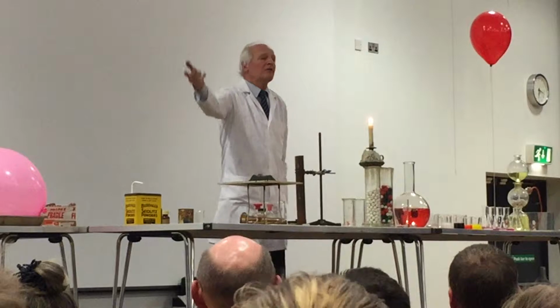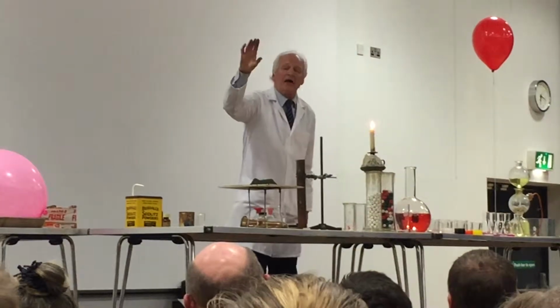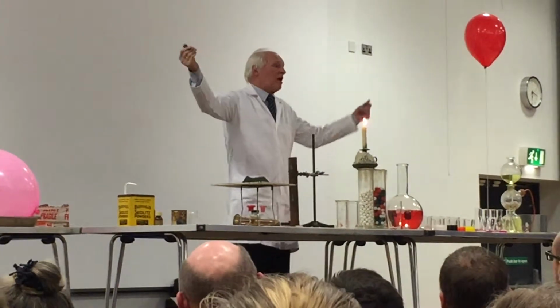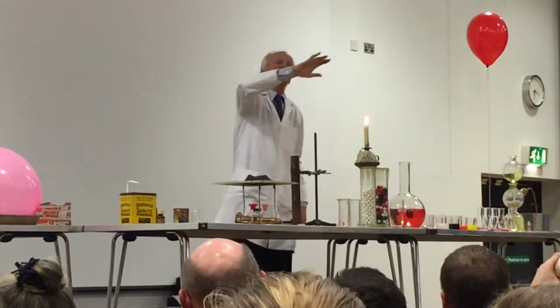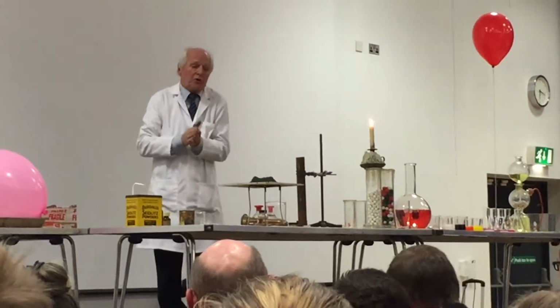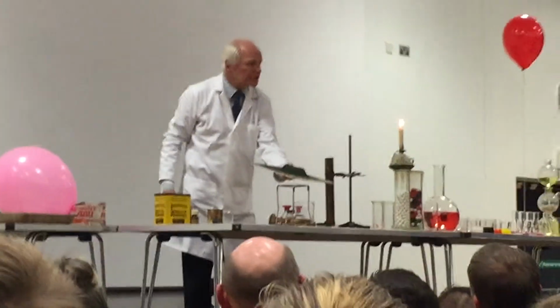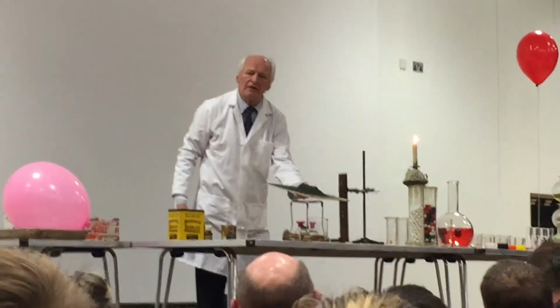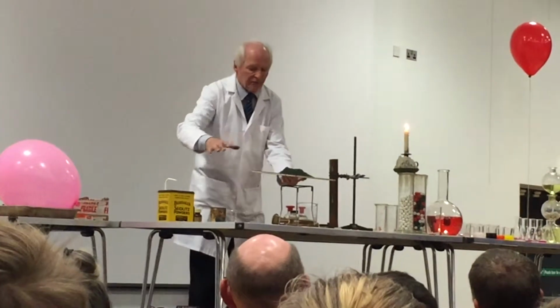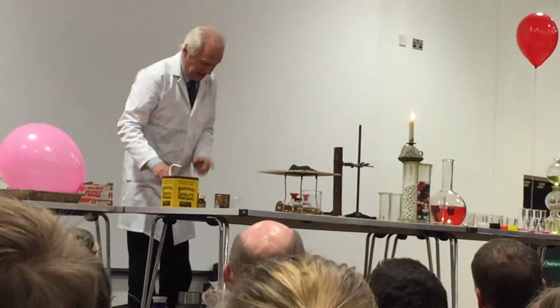There is nothing here that will pollute the air, because the only two products of this that have gone into the air are nitrogen gas, which is part of the air, and steam, which is also part of the air as water vapor. So there is no change whatsoever in the air around us in a way which we would notice. But you'll notice the orange powder has chemically changed. It has now become a dark green powder. This is called chromic oxide. This is nowhere near as toxic or harmful as the ammonium dichromate. So, another example of an interesting chemical change.